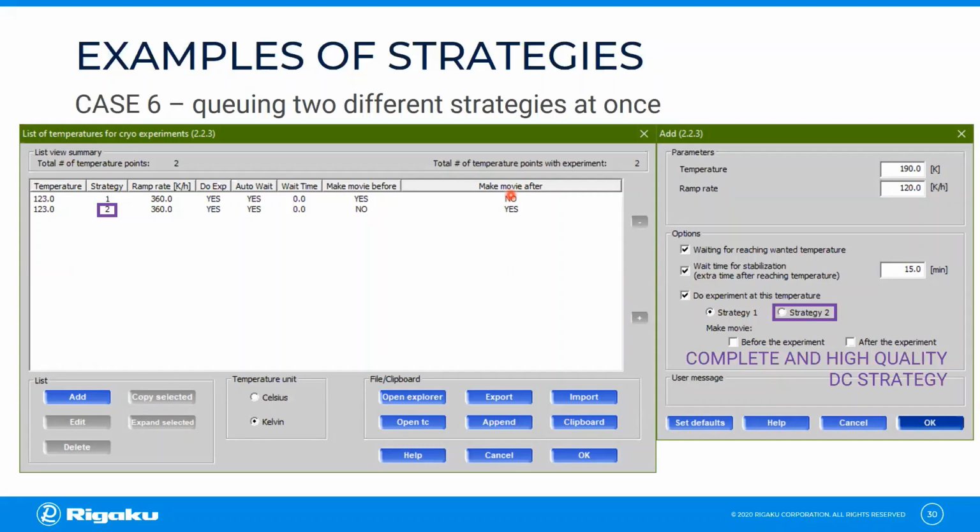By the time you have a chance to come back to the instrument, you should at least have the first strategy ended, and that allows you to cancel, change sample, or continue to collect data on the crystal without losing time. But you should at least have a low intensity target, so 60%, I over sigma 5. That's the target that usually shortens the data strategy a lot. And it could be even shorter than the beginning of your second strategy, to get the solution and confirmation of the sample composition.